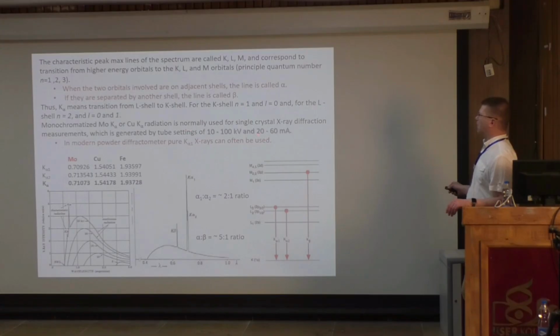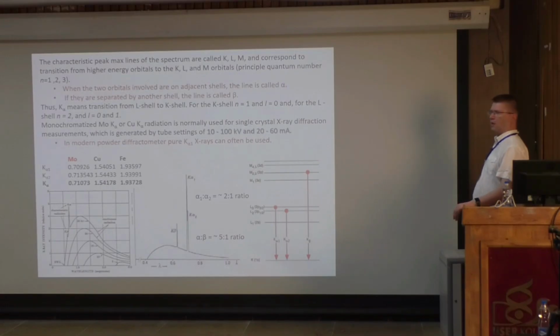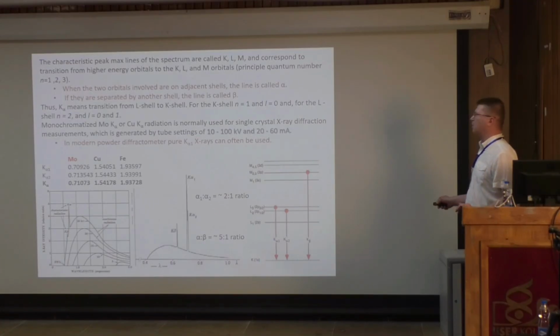So that's the idea. And what is the speed we need to get this done, so that we can see the characteristic X-rays? It is between 10 to 100 kV. Typically it's 50, between 40 to 50 kV is needed. And then we use a power, and you can see the power is much less. When you combine these two, you can get maybe 1,000 watts or so. That's the power we use to create X-rays.